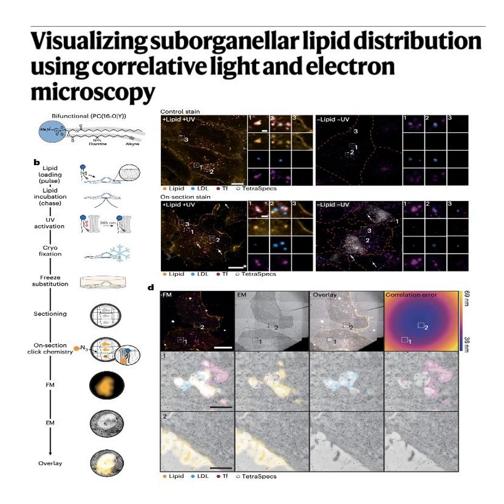But we have to talk about the resin itself now. We have the workflow. But capturing a 2D image is one thing. Calculating the actual three-dimensional density of those lipids is a completely different challenge. Because the physical film we use, the resin block, presents a chemical barrier. You can't calculate 3D density if you only look at the surface of the slice, right? Right. The click chemistry reagents actually have to penetrate deep into the resin matrix.